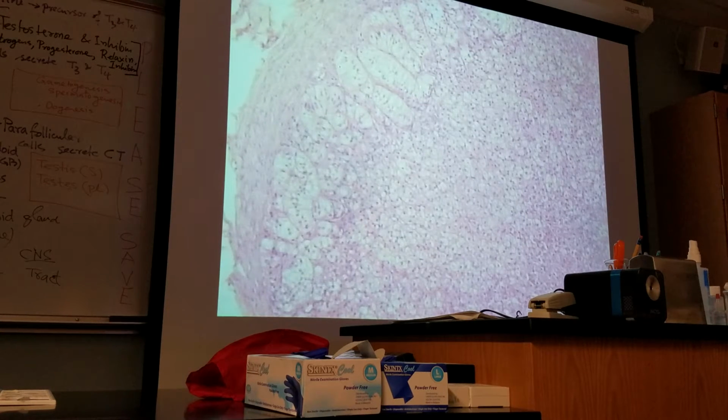And immediately below the zona glomerulosa, you can see the zona fasciculata, because these are very packed fascicles. And this zona fasciculata secretes glucocorticoids. What does zona glomerulosa secrete? Mineralocorticoids. Example, aldosterone. Here, example of glucocorticoids, cortisol.